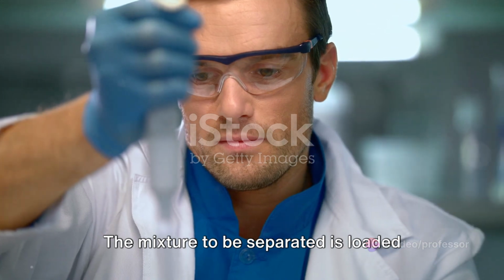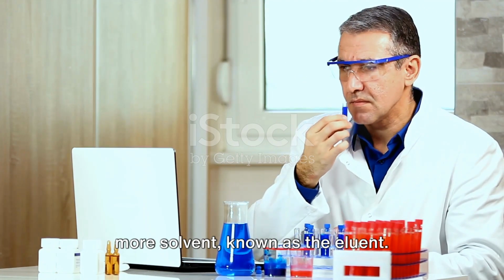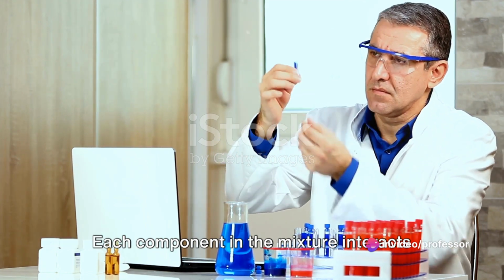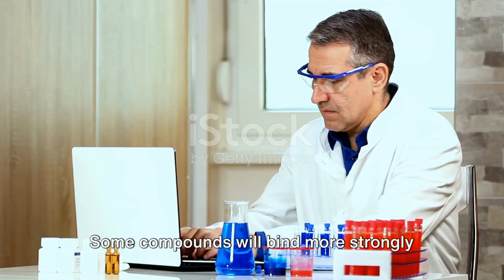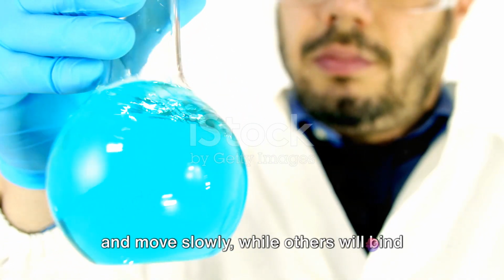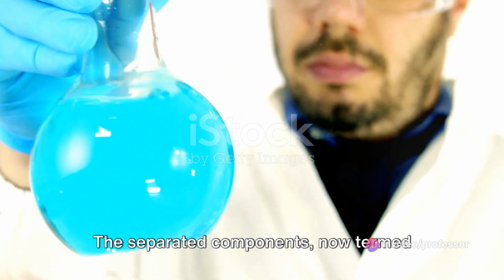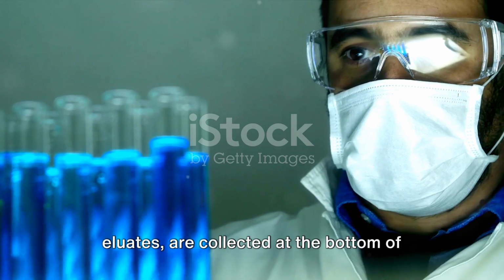The mixture to be separated is loaded onto the top of the column, followed by more solvent, known as the eluent. The eluent carries the mixture through the column, and here's where the magic happens. Each component in the mixture interacts differently with the stationary phase. Some compounds will bind more strongly and move slowly, while others will bind less and move faster. This difference in travel speed enables the separation of components. The separated components, now termed eluates, are collected at the bottom of the column.